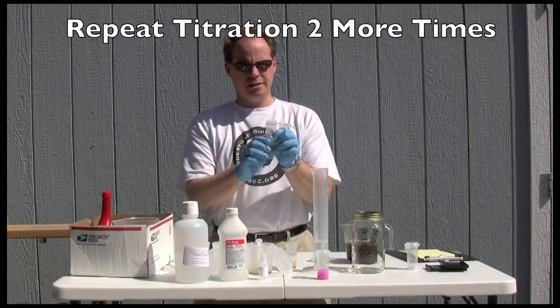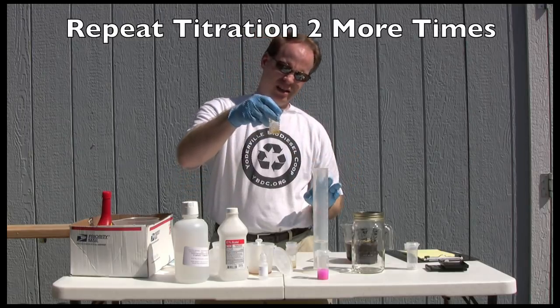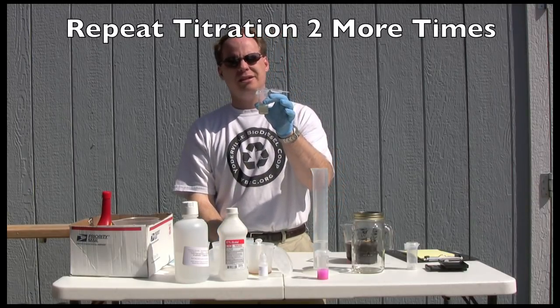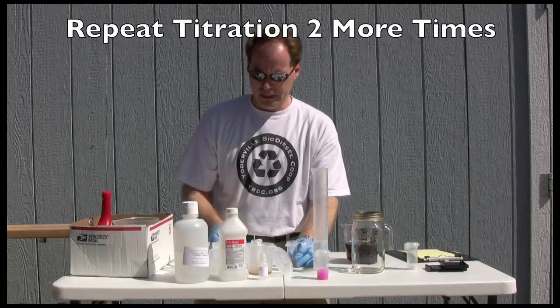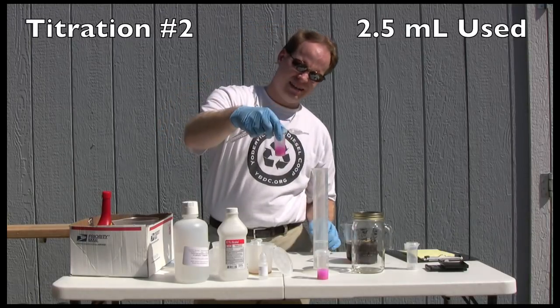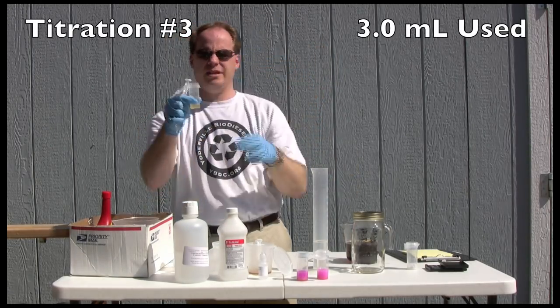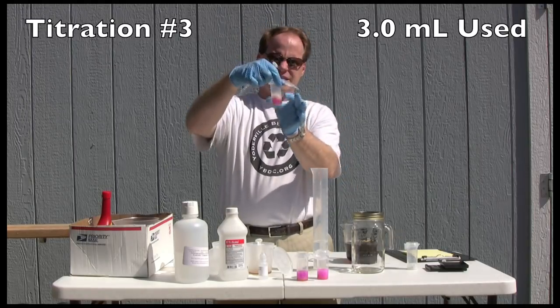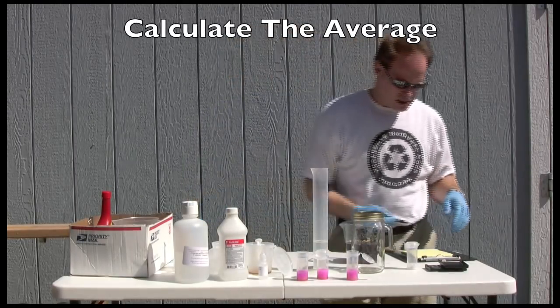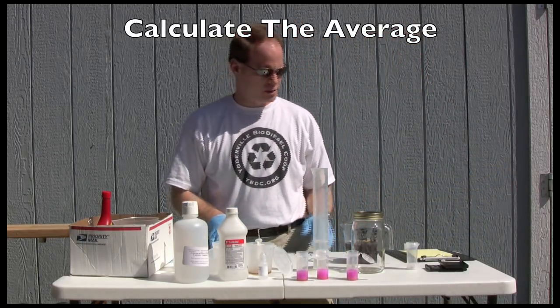It's now time to do our other two titrations. I always like to do three titrations on used oil. I now have some oil, some alcohol, and some phenolphthalein mixed up in each of two more vials — again, one milliliter of oil, 10 milliliters of isopropyl alcohol, and two or three drops of phenolphthalein. After completing all three, that's an easy average. We normally add the three together and divide by three, but this is going to equal three. So our titration result is three.